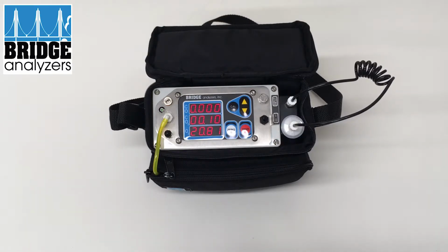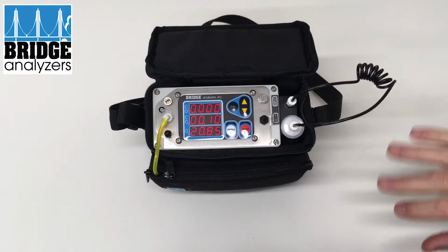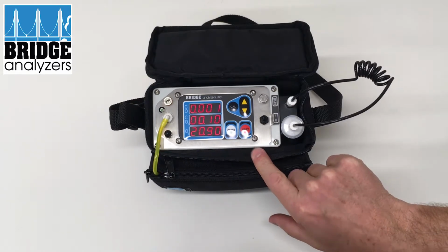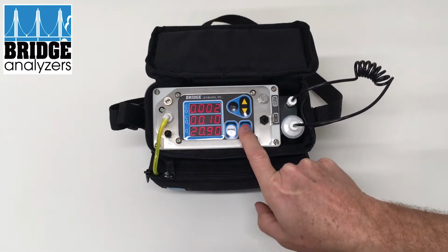So when you're in a case-ready meat package test or mother bag test, you don't want to run in continuous mode at all during testing. What you want to do is turn the pump on only when you're testing the package, not when you're testing the ambient air. Or we don't want to test the ambient air is probably a better term there. So to do that, basically we'll hit the test button, which is the red button.